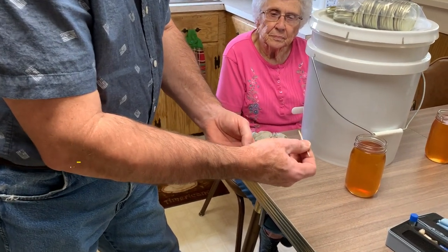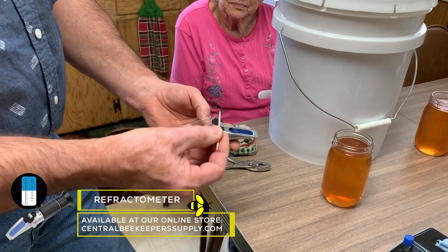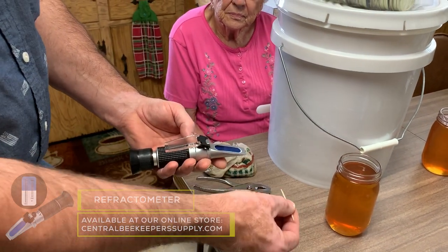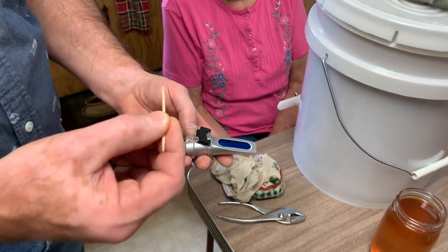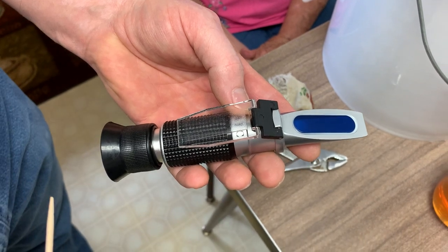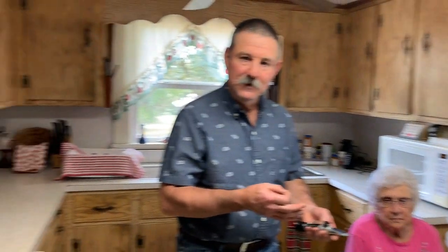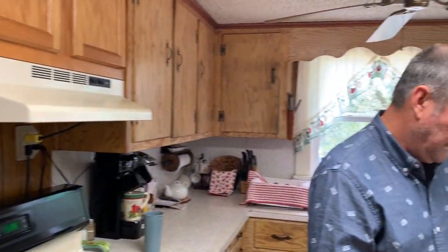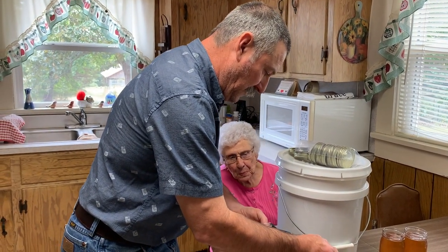We have a refractometer. We carry these at Central Beekeeper Supply. What we're wanting to find out is the moisture content in the honey. If the honey bees have not capped a cell, but yet we end up spinning some that was not capped into the capped honey, typically your capped honey is dry enough to absorb the extra moisture in that comb honey that was not. So with that being said, I'm going to load a dollop here, a small one, on the refractometer.